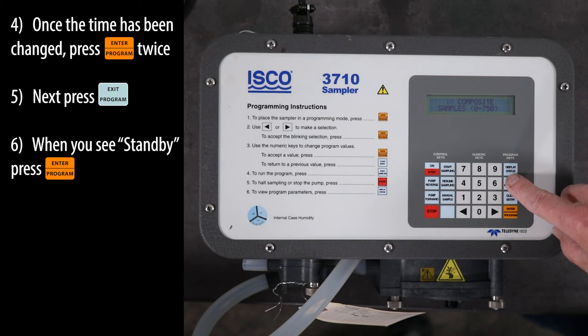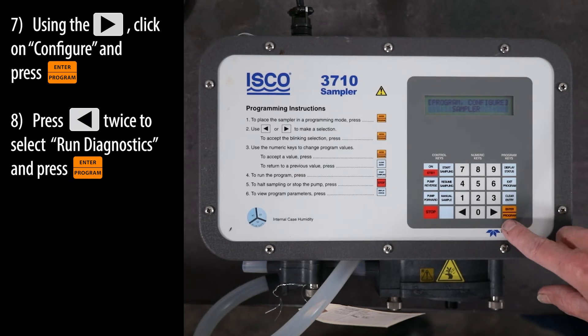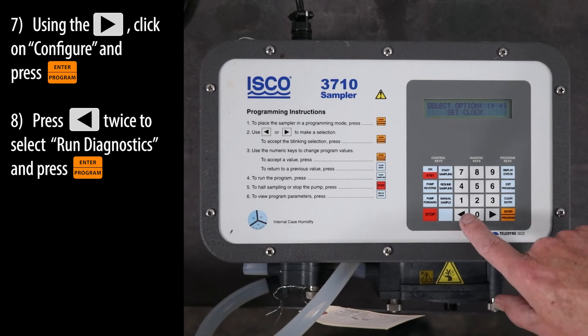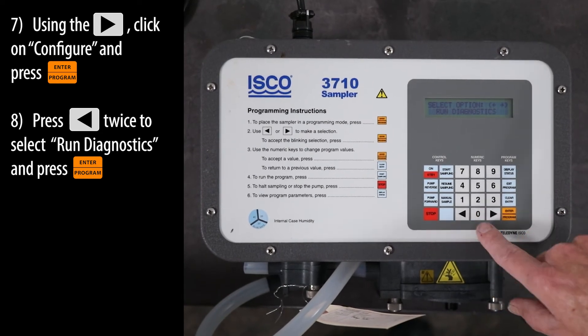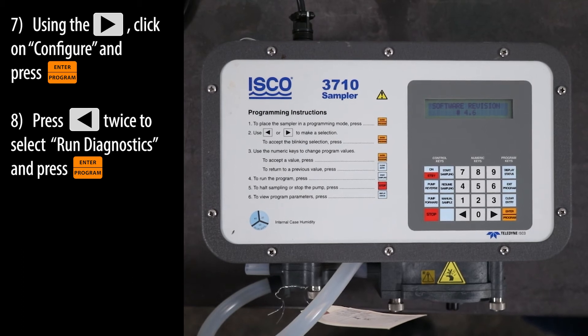When you see standby, press the ENTER program key. Using the right arrow key, click on configure and press the ENTER program key. Press the left arrow key twice to select run diagnostics and press the ENTER program key.